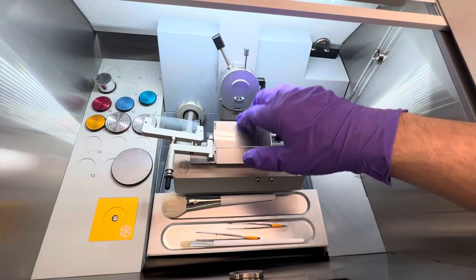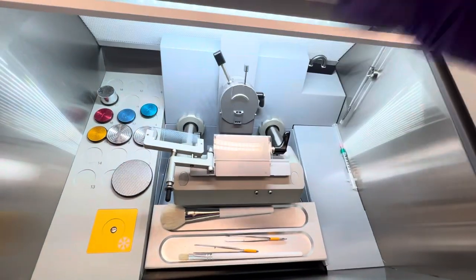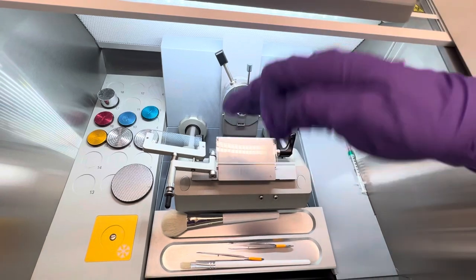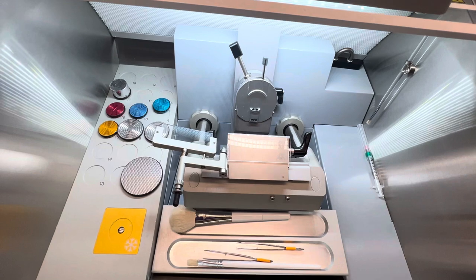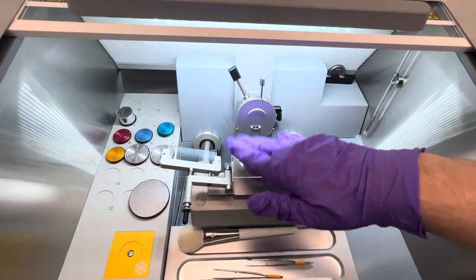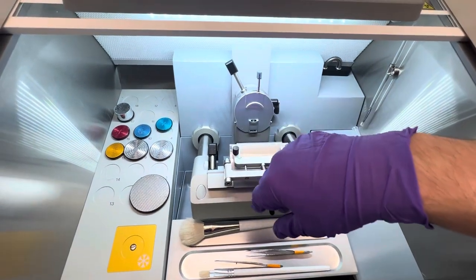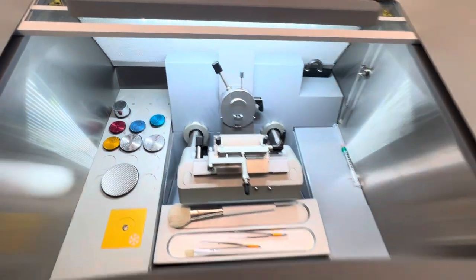To go over it again, if you do cut your hand with a blade, immediately put pressure on it so you're not bleeding everywhere. And even if you do get a few drops here and there, just inform your lab manager so you can sort it out and clean it off. Ideally, you can clean it off with 100% alcohol, but if it freezes to the OCT block, you might just have to chip away some of the block that has the blood on it. But I'm just telling you the haphazard solutions, hopefully you won't encounter that. You're going to be safe and not have that happen, but usually people have it happen at least once before they learn the lesson. I've had it happen once, but fortunately I was able to get my hand out in time, so it wasn't bleeding everywhere.